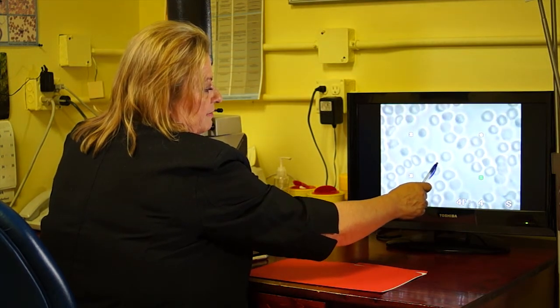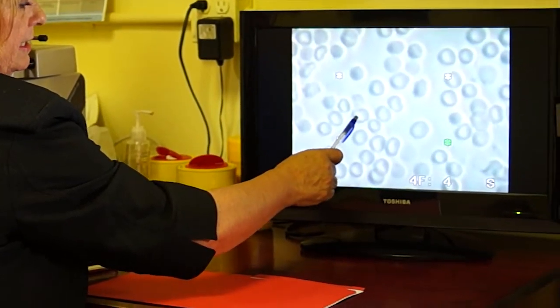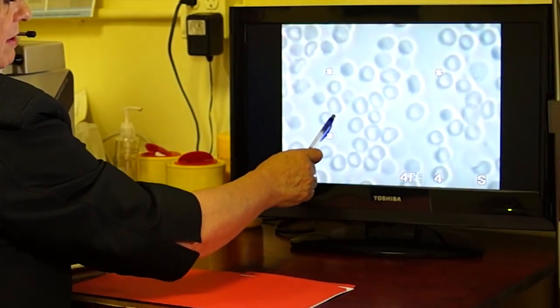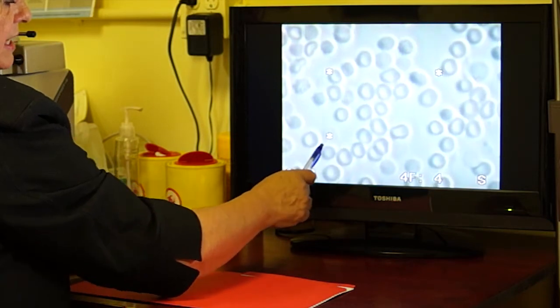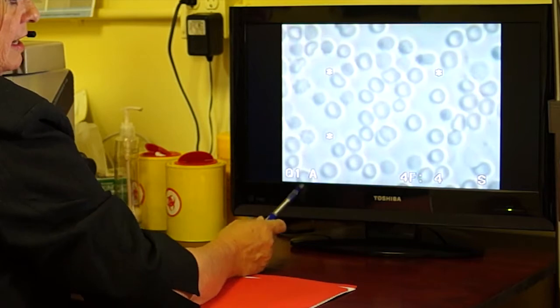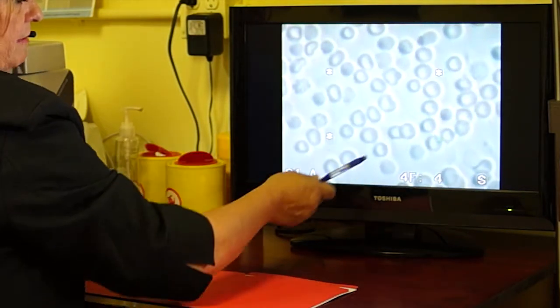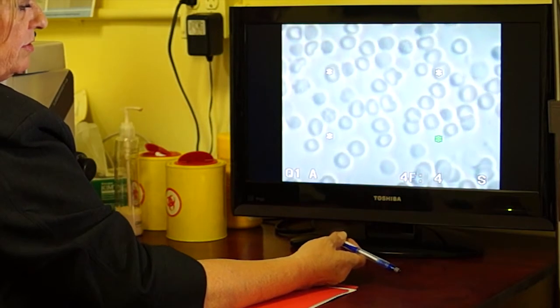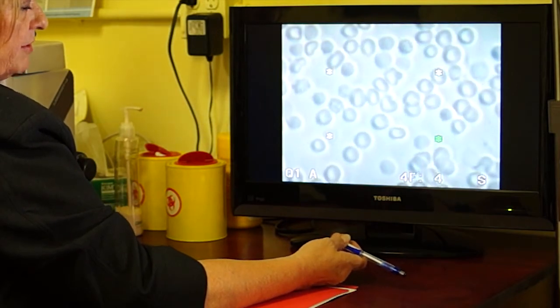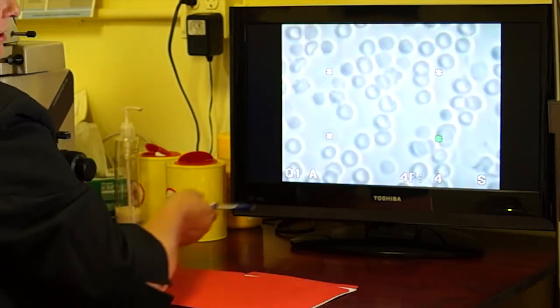A cell that is a perfectly normal cell has oxygen in the middle, that's indicated through the white light. Good nutrient ring around the oxygen. It's free floating and it's the right size. So a size somewhere around that is perfect. We like the fact that the cells are free floating because that provides you with better oxygen, nutrition, and circulation to your extremities.